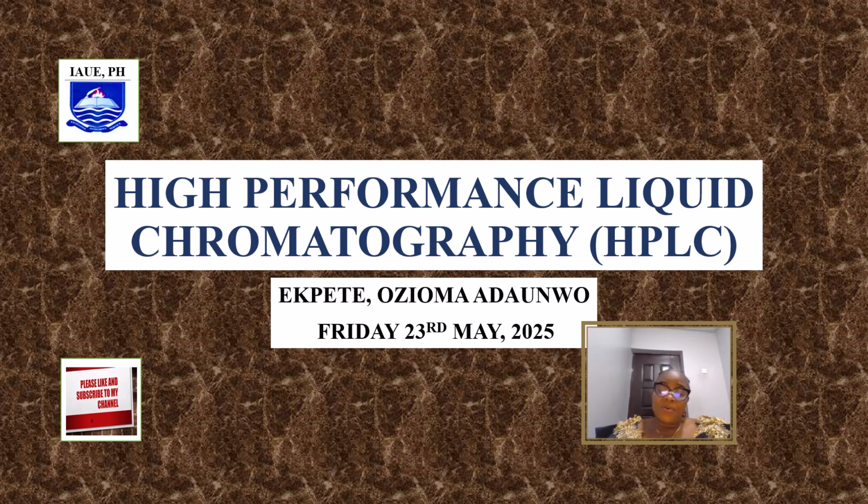HPLC is a technique for analyzing, identifying, and quantifying each component in a mixture. It uses high pressure to push the molecules through the column packed with the stationary phase. It can find the relative amounts of a component in a mixture. HPLC separates chemicals dispersed in a liquid sample, allowing for quantitative and qualitative examination of which components are present in the sample and how much of each component is present.